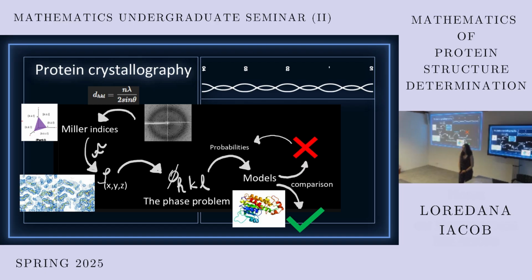And this phase that you cannot find after you do the inverse transform. Yeah. Is this the phase between the...? It's the phase of the ray at the beginning of the wave. It's like the first phase when it interacts with the crystal. When it leaves the generator, the wave arrives and reflects. When it leaves the source, we don't know what phase it is in. It can be 0, it can be pi/2, we don't know.